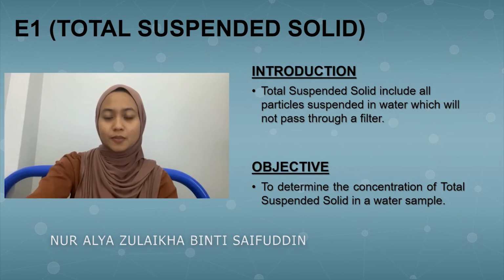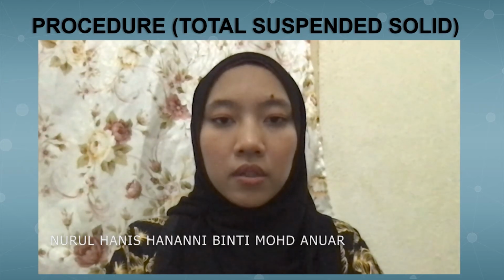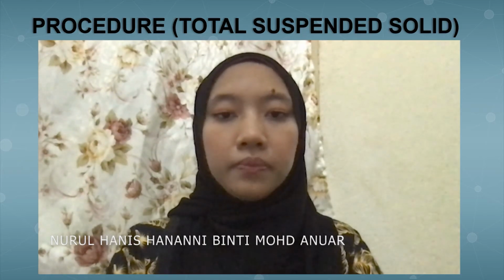Introduction of total suspended solid. Total suspended solid includes all particles which will not pass through a filter in a water sample. The objective is to determine the concentration of total suspended solid in a water sample. So we proceed to the procedure.